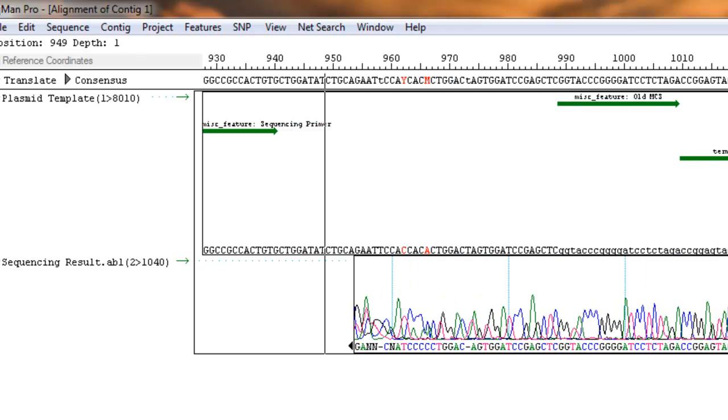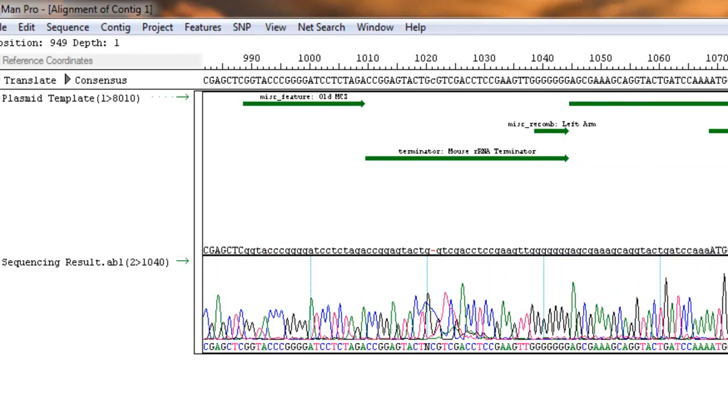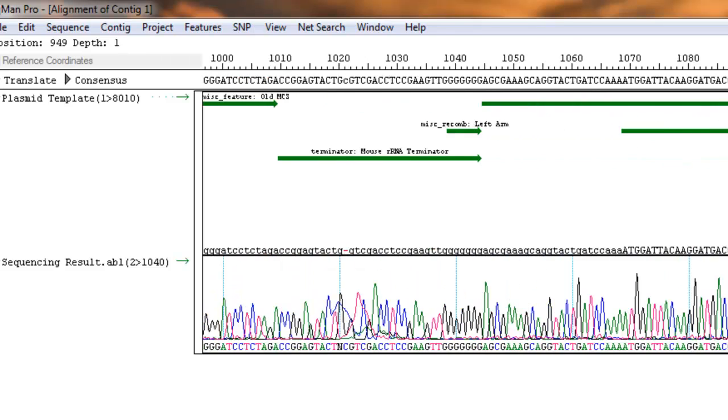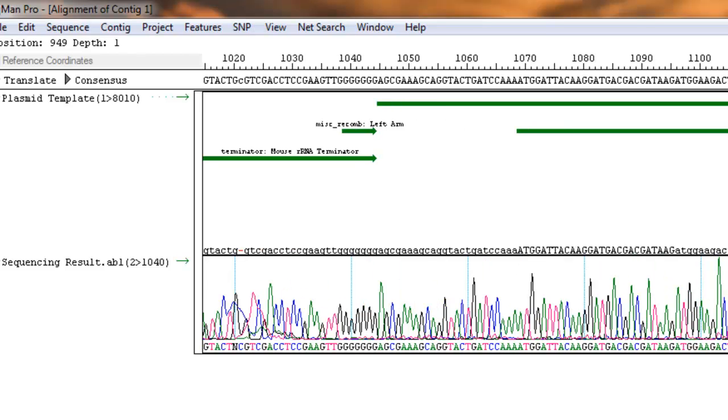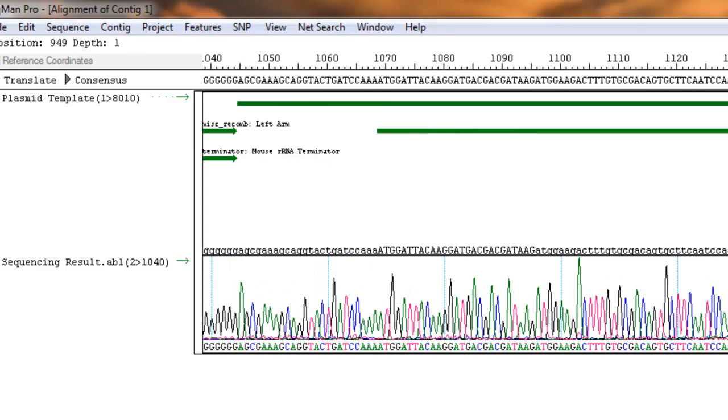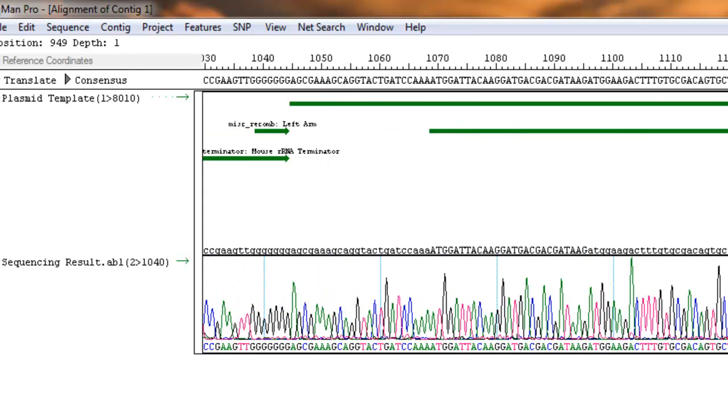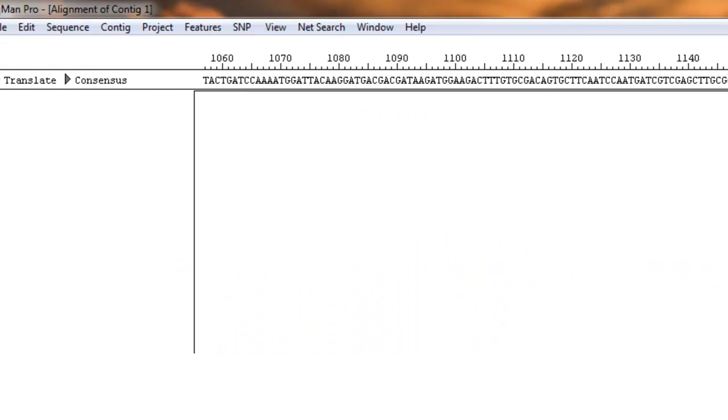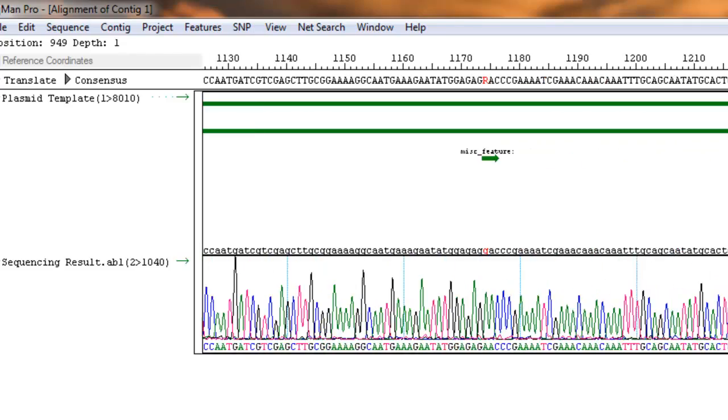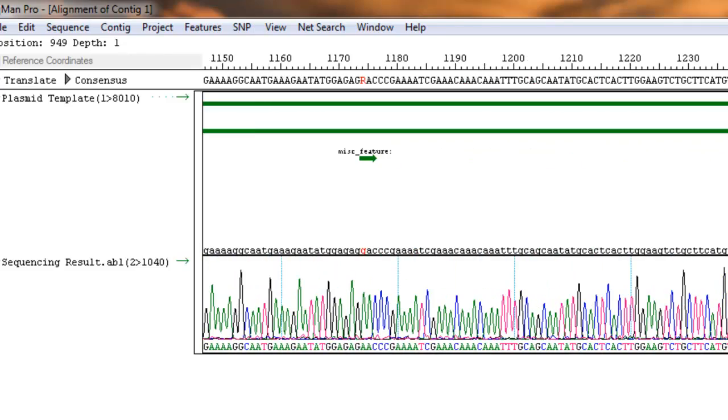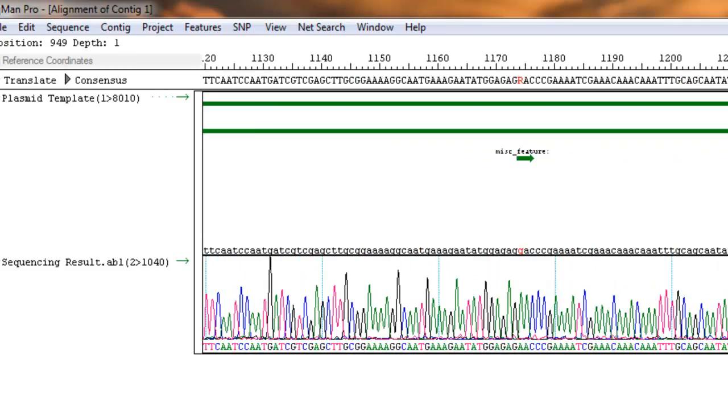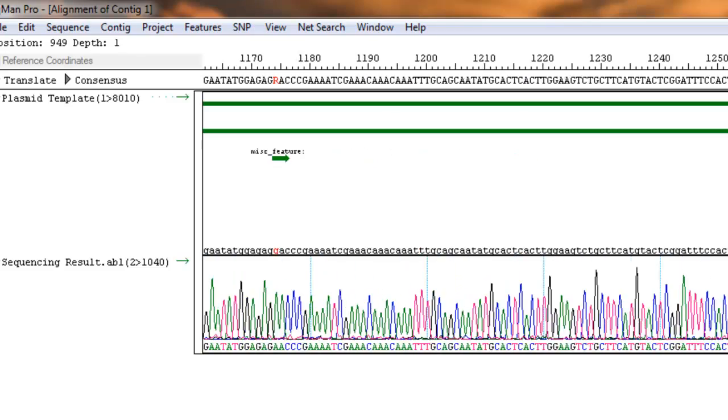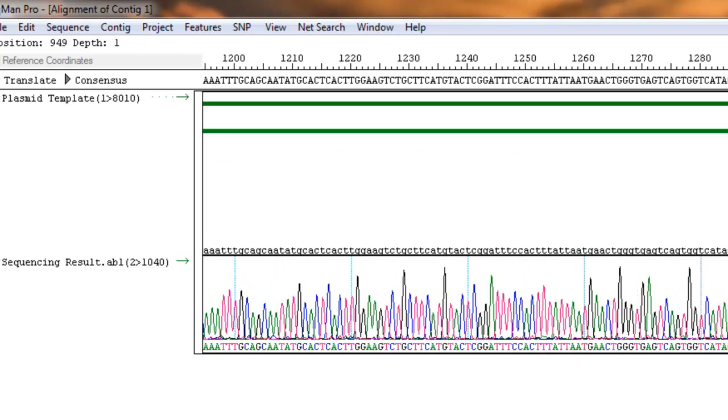But as you scroll through, you can see that the chromatogram becomes much sharper. And this is basically where it's relevant. So you want to make sure at this point that your sequences match up, right? So this all looks very good. And it does match up indeed. There's no mismatches or anything that I can see.